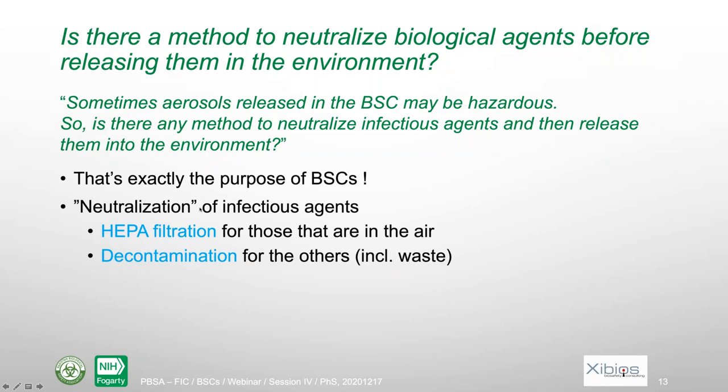Neutralization doesn't mean much to me in this case, but anyway, eliminating and inactivating infectious agents is done by HEPA filters for those that are in the air, and by decontamination for all the others, like the surfaces of the biosafety cabinet, but also all the items, including waste, that are in the biosafety cabinet. For surfaces and for solid items, we use chemical decontamination. For waste, we can use, for instance, autoclaving or incineration.